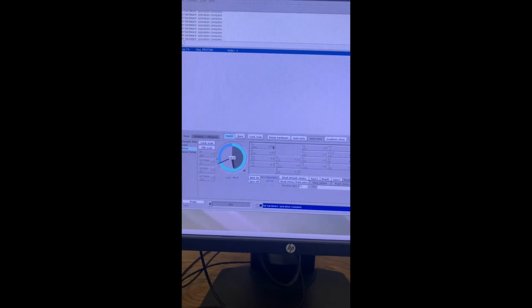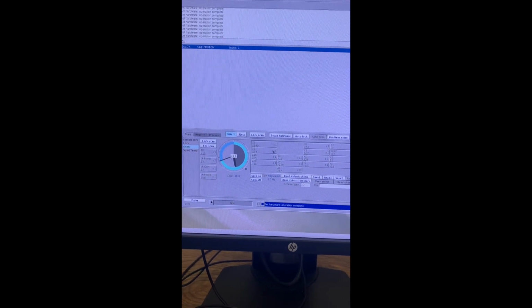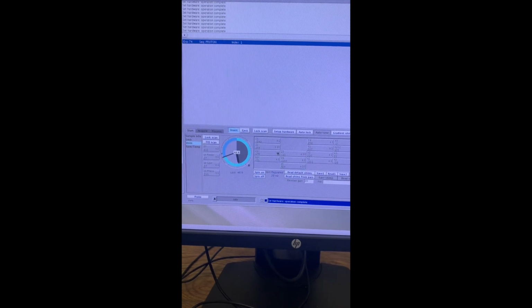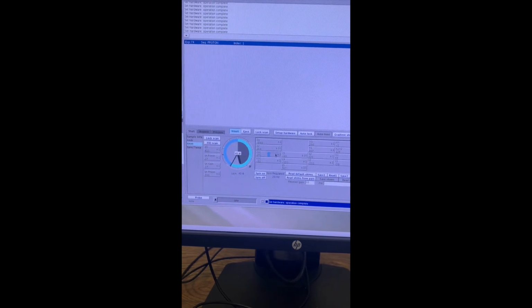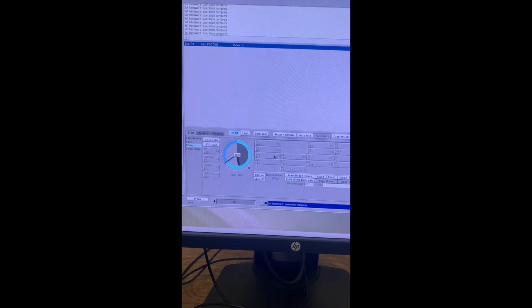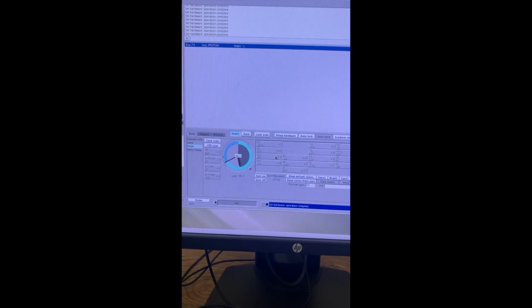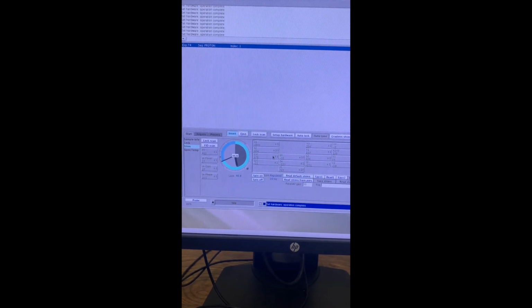to the shim tab. In the shim tab, you're not going to touch anything on the left, the Z0 lock power and lock gain, because those are already optimized when you did the lock signal. What you're going to adjust though is the Z1, Z2, and Z1C signals. You can adjust them also by increments of 1, 10, or 100. And what you're going for here is to optimize the signal strength. You're going to look for the field to increase, and you want a signal strength between 60 and 70 range. In case of a surge, you don't want to fry the machine, but you don't want it to be too low that you're not going to get a signal.